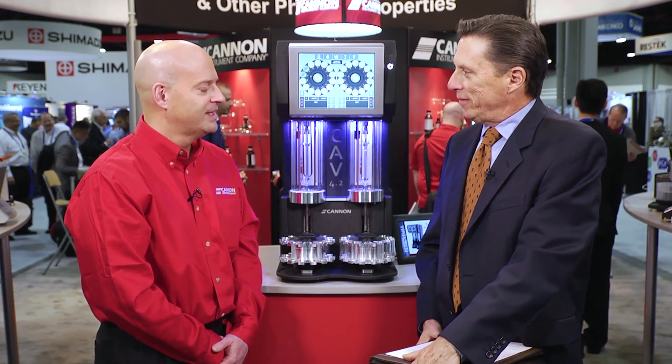Thank you, Pat. The CAV 4.2 sounds like a great advance in viscosity measurement. Thank you, Steve. We're pretty excited about this instrument, and our customers are as well. For those interested in more information, please go to CanonInstrument.com.